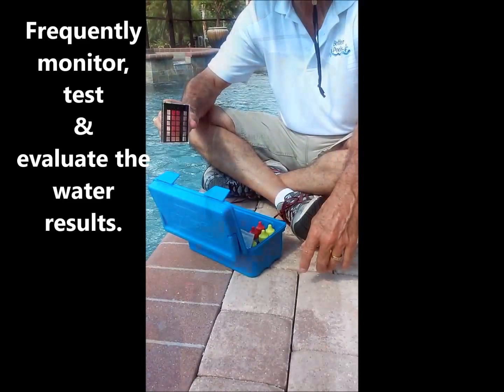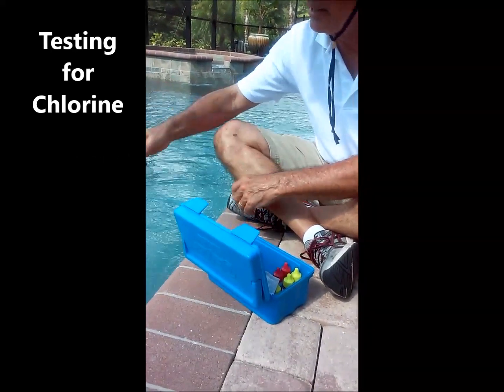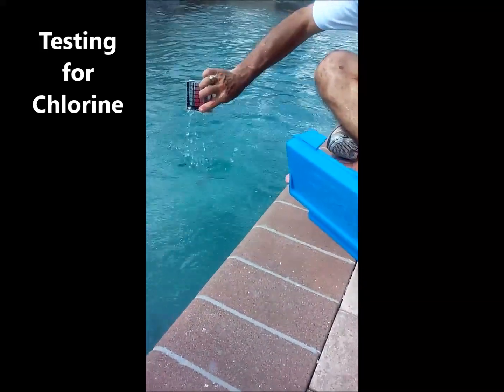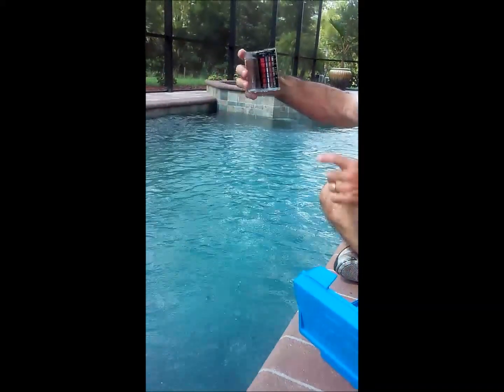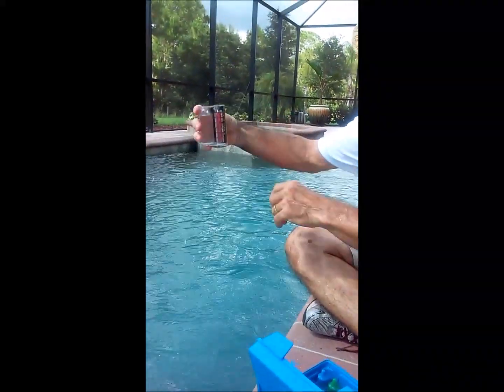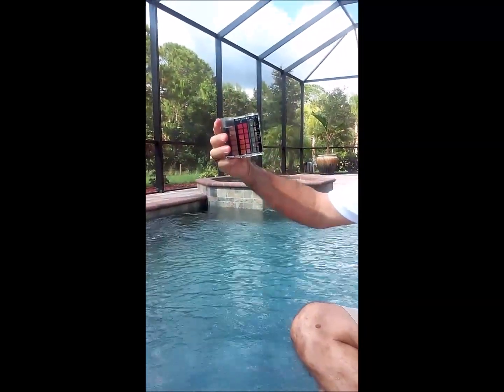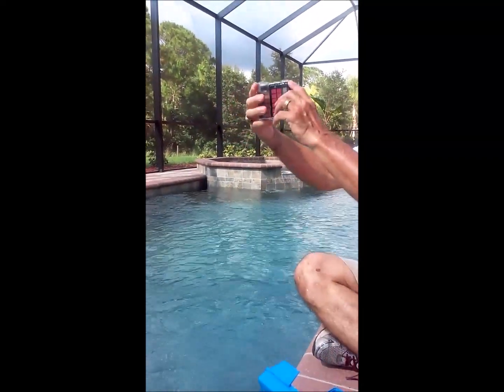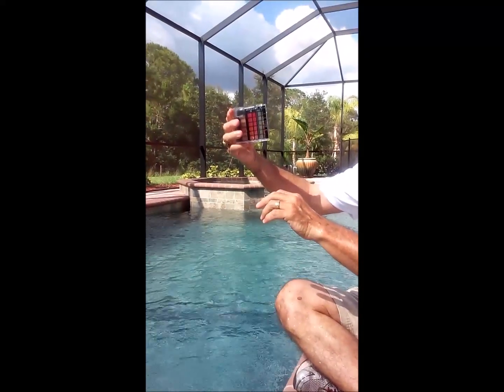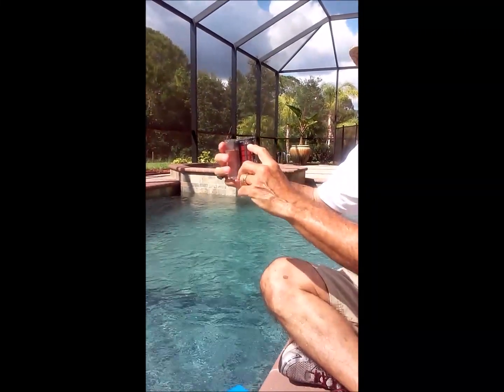The first test we're going to do with the Taylor test kit is chlorine, which is the reading on the left side. We're going to rinse out the containers, then fill the small one to the nine millimeter mark. The bottom of the bubble should be right at the nine millimeter mark.